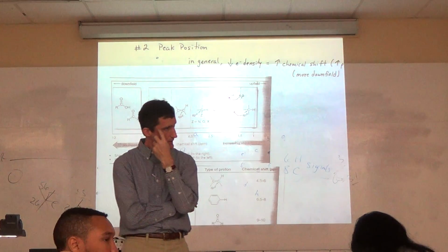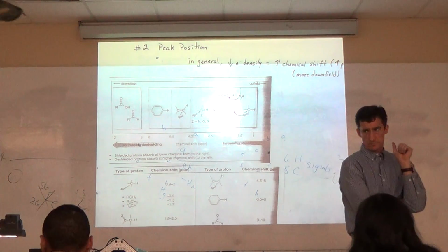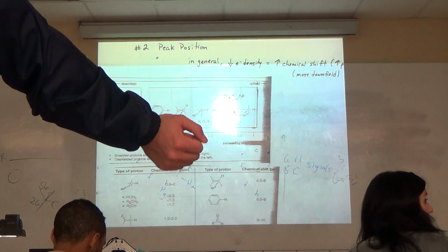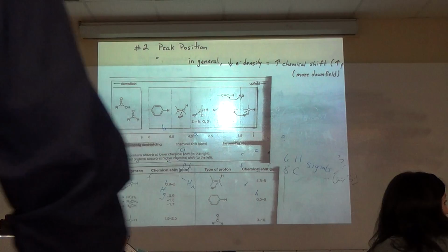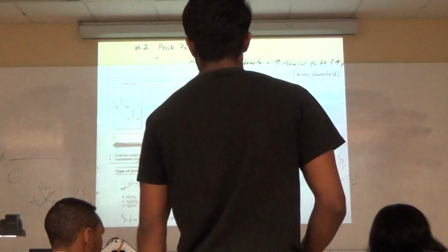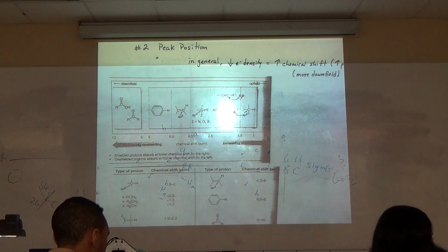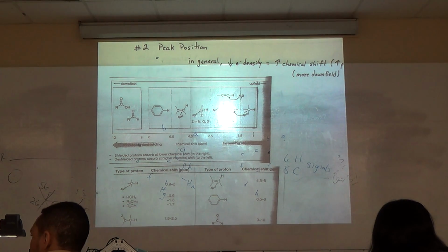Dr. Stevens, on some of these the TMS signal is going to be there, and on some it's just removed because it's not calibrated. Some of these may be computer-generated spectra and they didn't include it. So if we ever see one at zero, just assume that it's the baseline. We don't have to worry about that. Actually, I don't use TMS because there are other ways to set your baseline. If you want to know, you can come by and ask. You can actually use your solvent peak to set the baseline, like the DMSO peak.